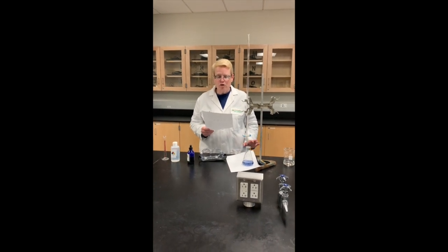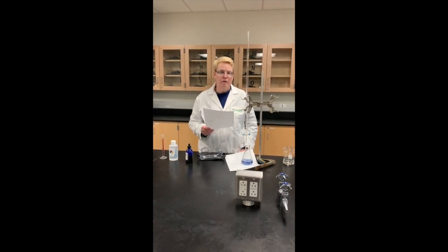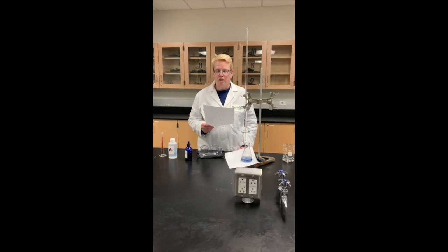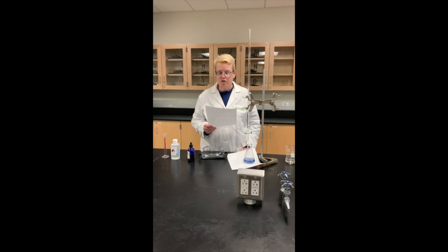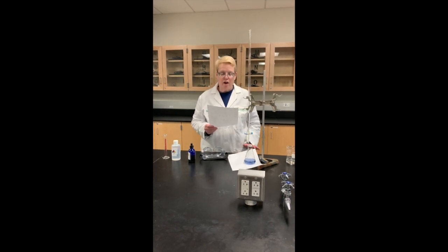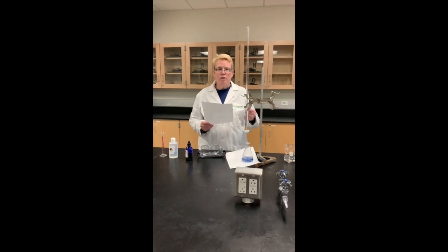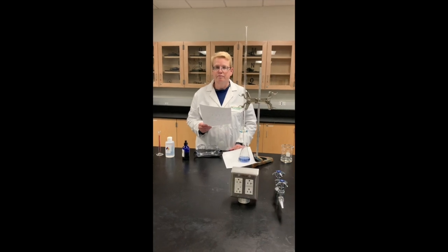So we did trials 2 and 3 for the standardization, and in trial number 2, our initial volume of EDTA was 0.01 milliliter, and the final volume was 43.95 milliliters. And in trial 3, we used 0.00 milliliters as our initial volume of EDTA, and our final volume was 44.02 milliliters. Now remember, for each trial, we used 25 milliliters of the calcium standard.